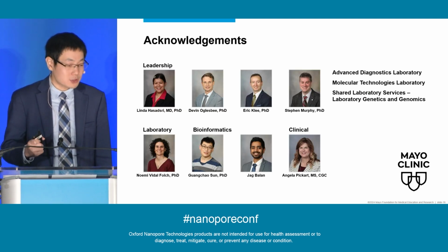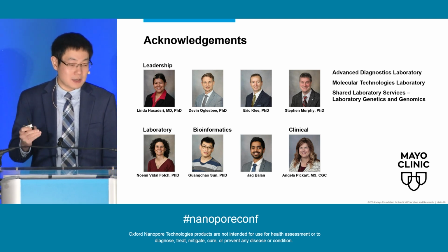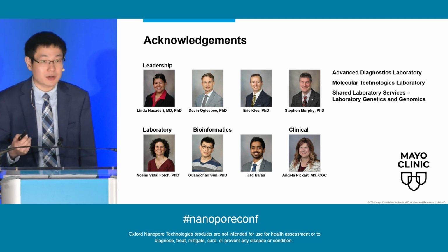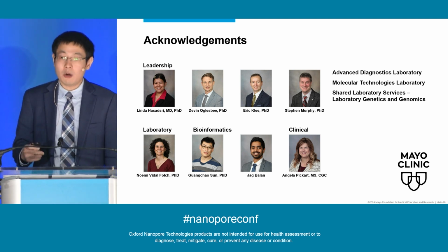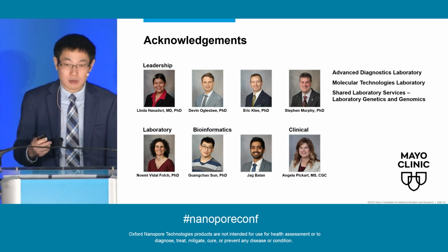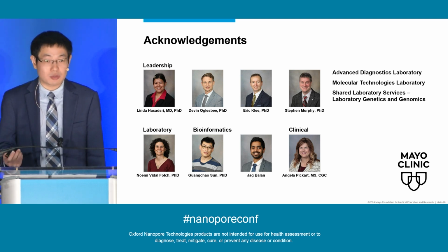And in terms of future directions, the first thing, as we also heard from the presenters this morning, is that we are hoping to have better automation in our process. Are we going to have an SV caller that can, without manual inspection of the BAM file, be able to determine the structural configurations? We're hoping to test this in additional clinical samples to see if our conclusions from this pilot hold. And we are also interested in testing this methodology in additional regions.